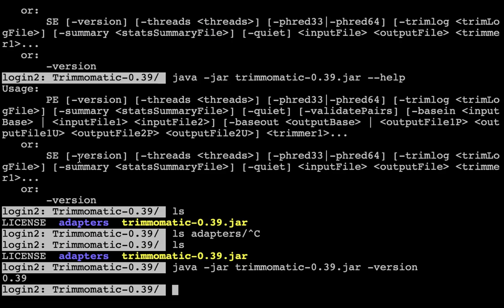applied. So all the bad reads will have been removed, and then reads that totally drop in quality after a few bases are also going to have been removed. Okay. So that's what I wanted to say for processing FASTQ files. Do you have any questions before we switch to a different topic? Questions on FASTQ files, reads and just raw libraries?